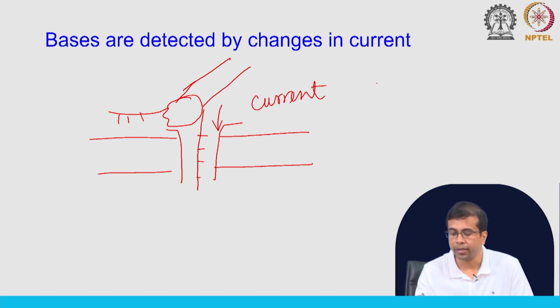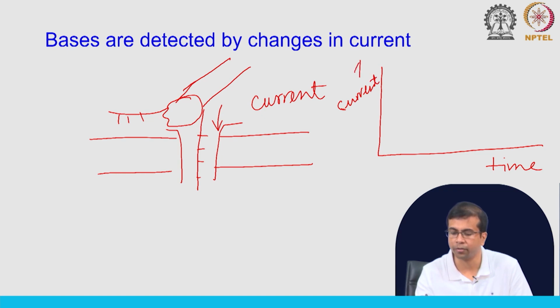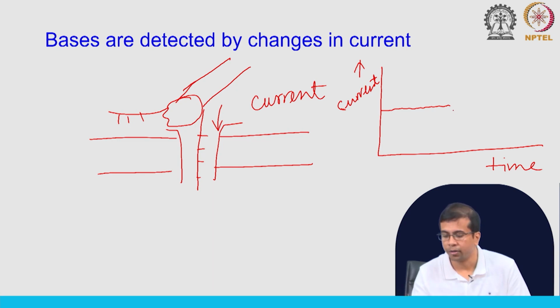Okay. So, you can imagine this situation. If we are drawing this time versus current, the y axis is current, in picoampere. So, very small current. So, let us say we have this kind of constant level of current that is passing through the nanopore, and then at this point we start passing the DNA molecule through the nanopore.